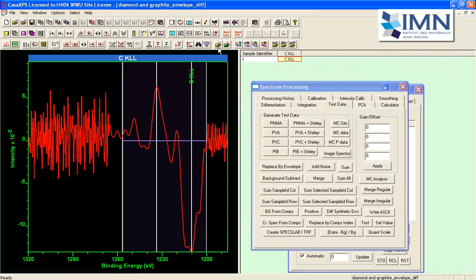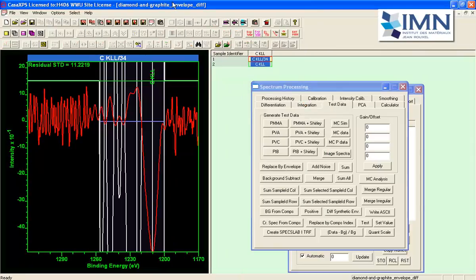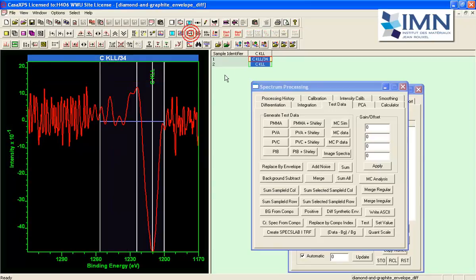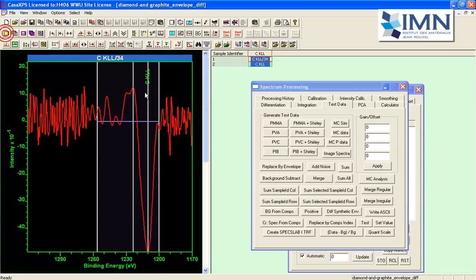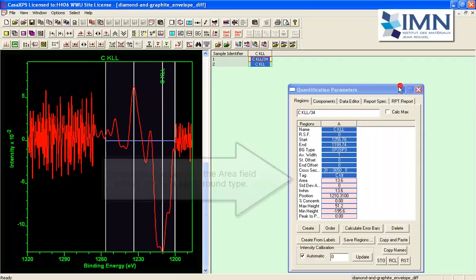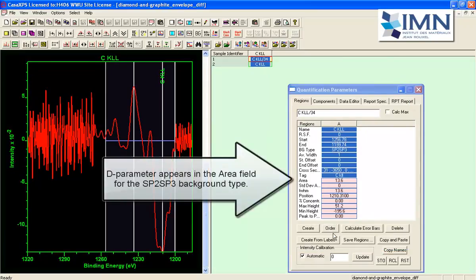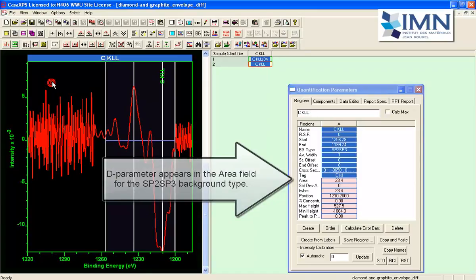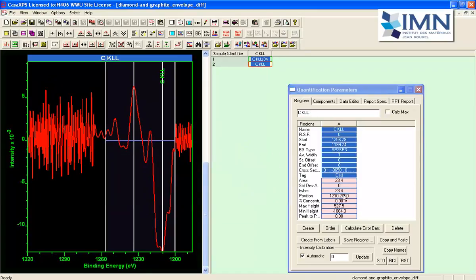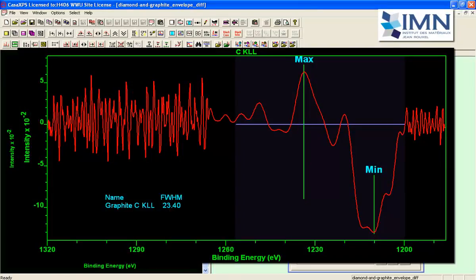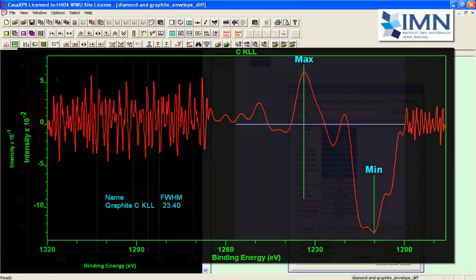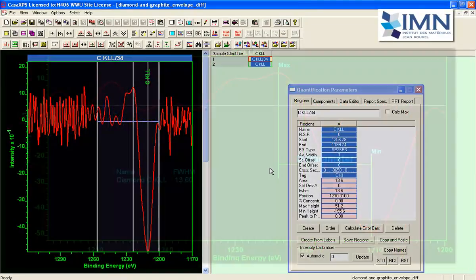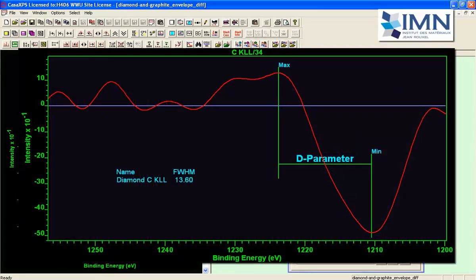Again I'll just turn off the residual so it's clear and let's display both of these so you can see now we've got 13.6 this one is 23.4 so this is a graphite and this one is the diamond.